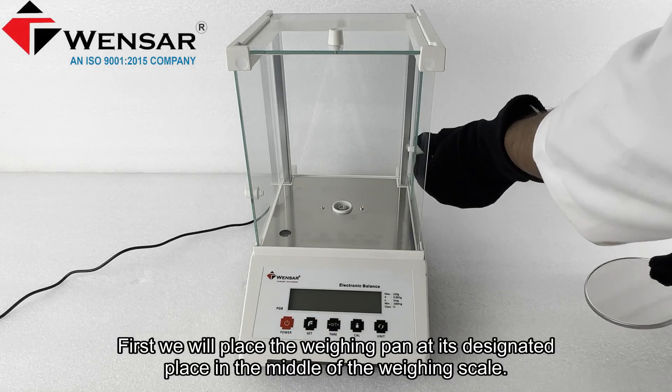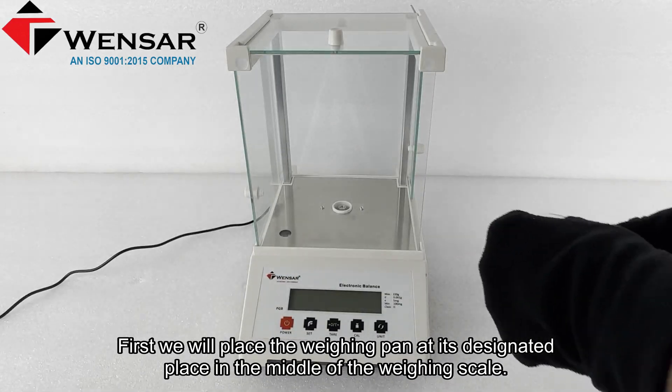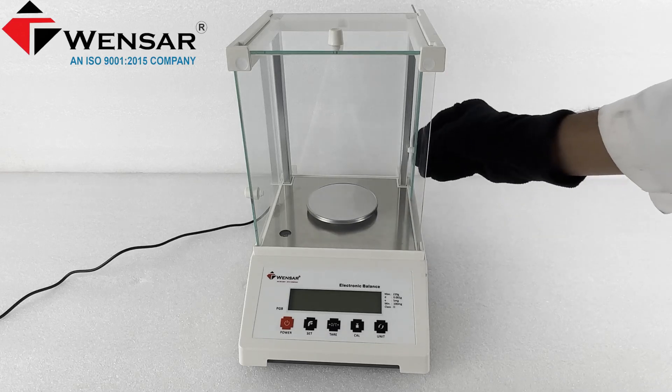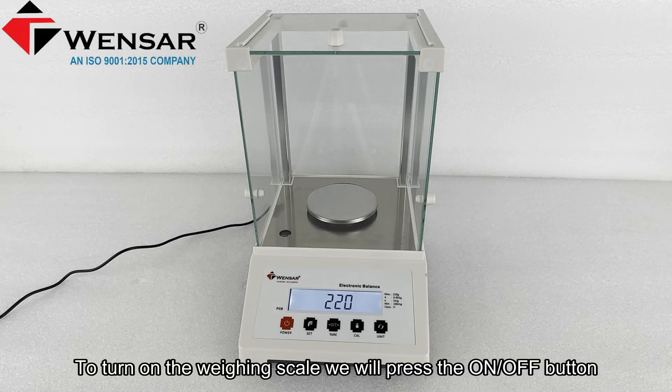First, we will place the weighing pan at its designated place in the middle of the weighing scale. To turn on the weighing scale, we will press the on/off button.